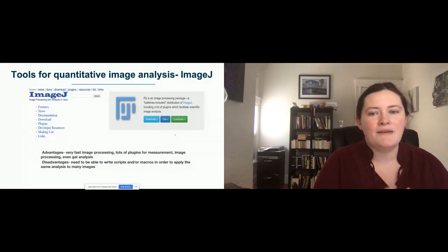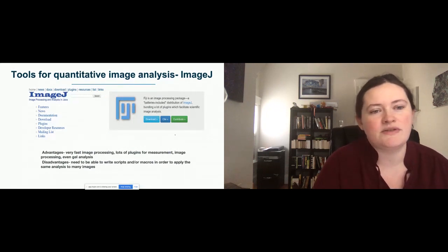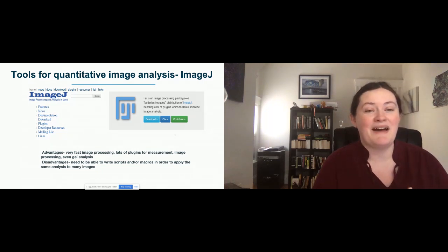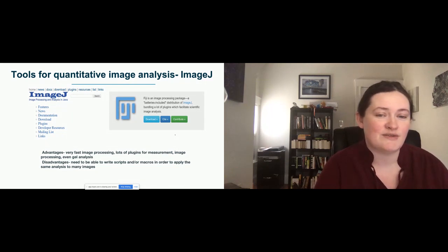And there are many amazing open source image analysis tools. Ours is one in, as I said, a vast, wonderful ecosystem. Almost everyone here, I'm guessing, has used ImageJ or Fiji. I'd be curious if anyone hasn't. But this is often the first image analysis software you learn to use as soon as you've sat down at the microscope. And I use this every day.